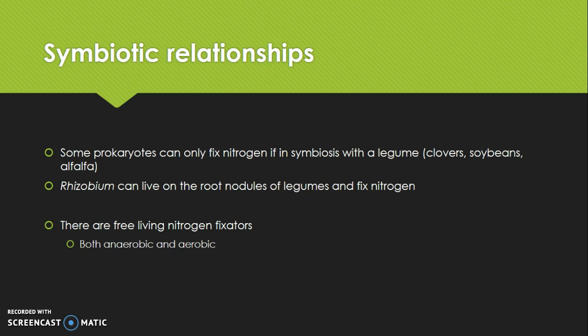Okay, I think experiment 34, 35, 30, no, it's 36. Okay, so the experiment 36, if we flip to it, should be on page 197. It talks about the symbiosis, the rhizobium legume mutualism. I think that has to do with nitrogen fixation. Yeah, it does. It goes over more there, but some of them have to be in that relationship to fix nitrogen, like rhizobium, which lives on the root nodules of certain legumes.